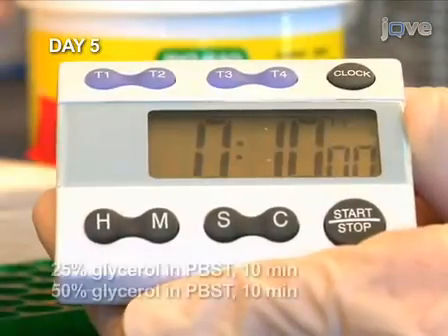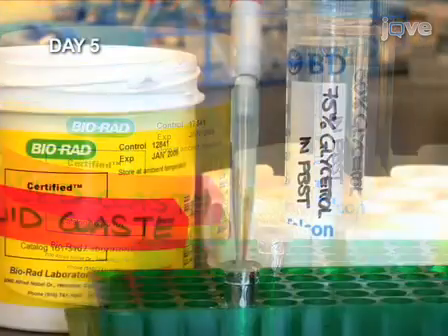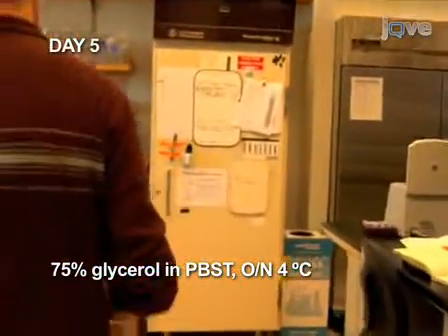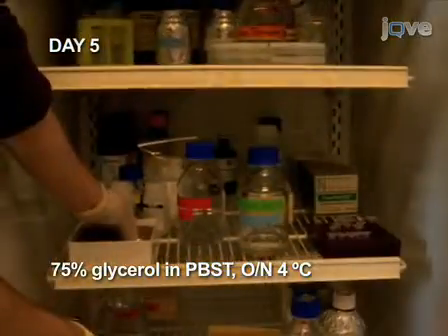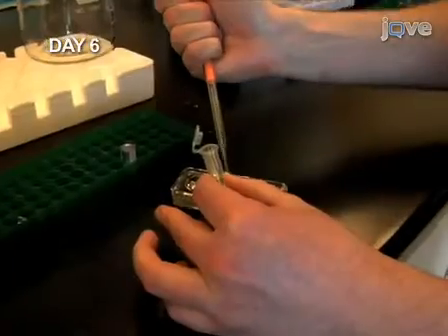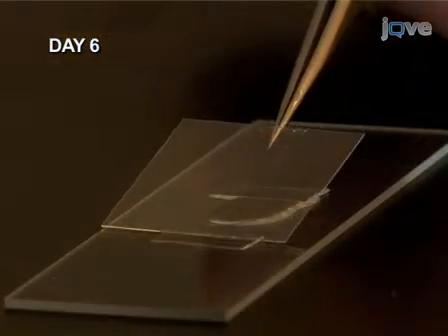Mounting the embryos for viewing starts with two 10-minute incubations in 25% and 50% glycerol. Next, put the samples in 75% glycerol and incubate them overnight at 4 degrees Celsius. This overnight clearing step makes dissection of the embryos easier. Finally, dissect and remove the yolk from the embryos in order to reduce background fluorescence. Flat mount the embryos on a microscope slide and examine them under the microscope.